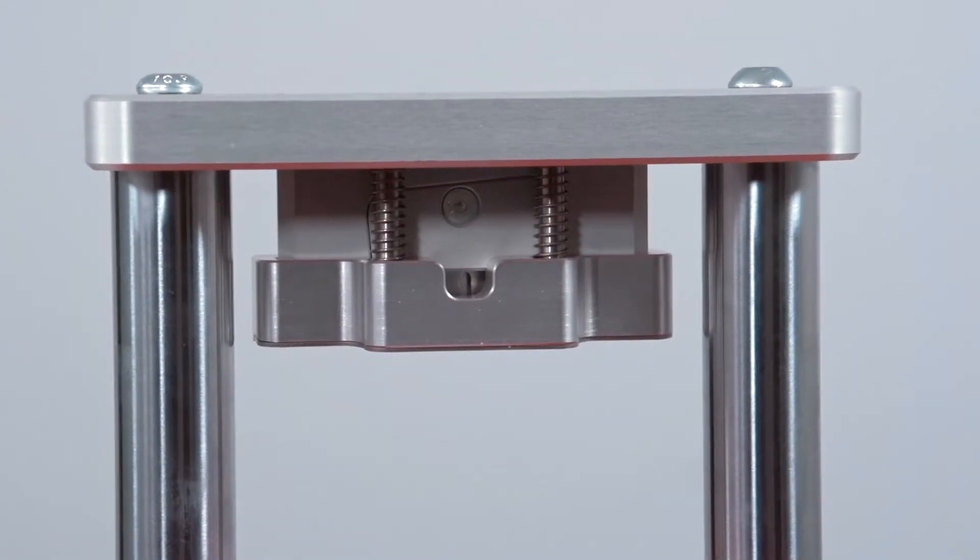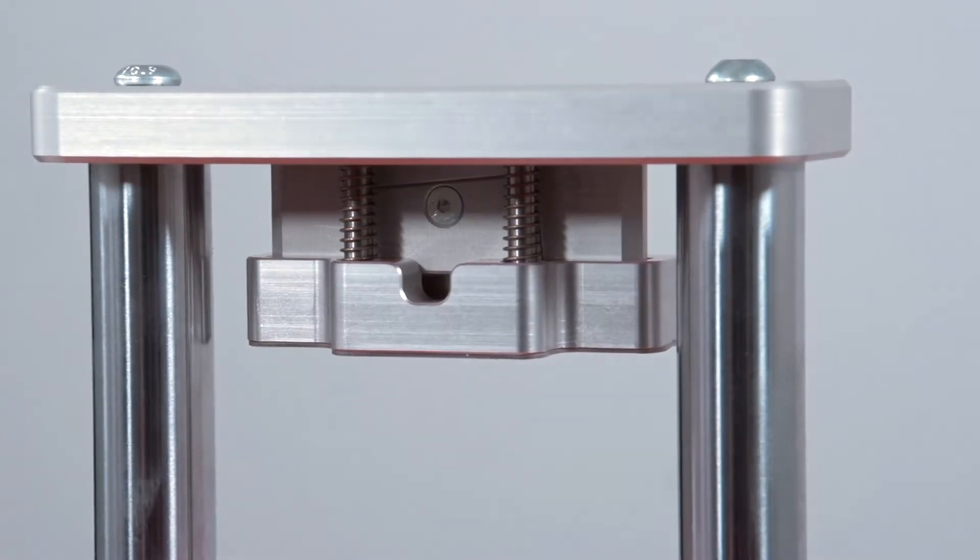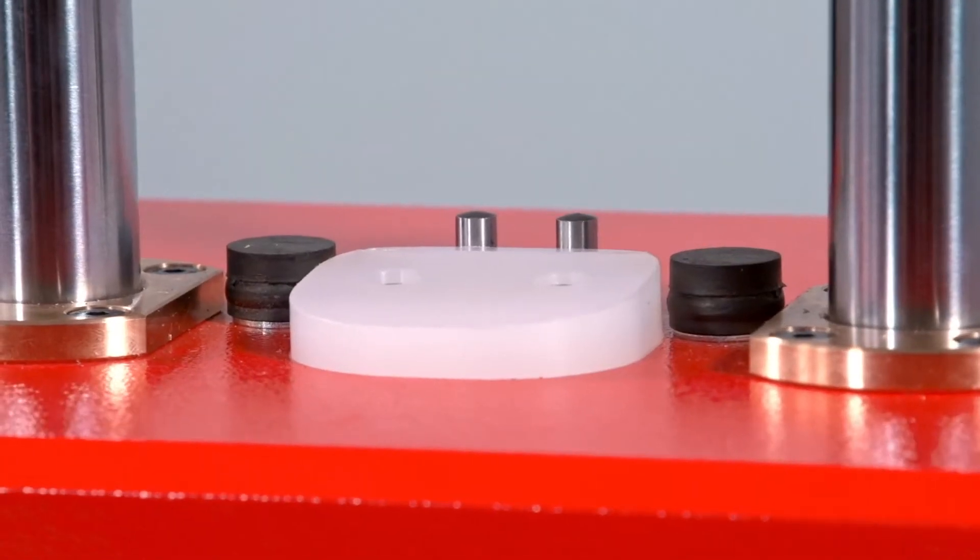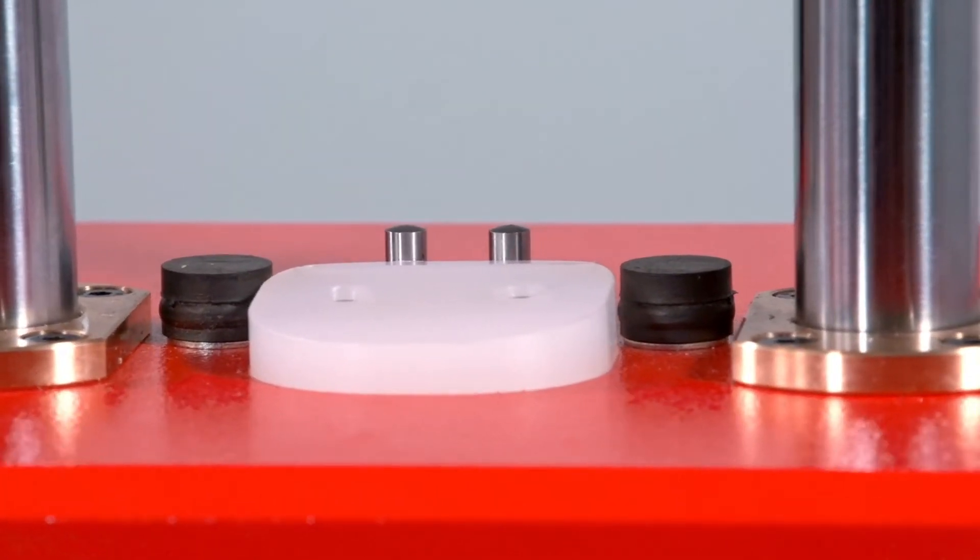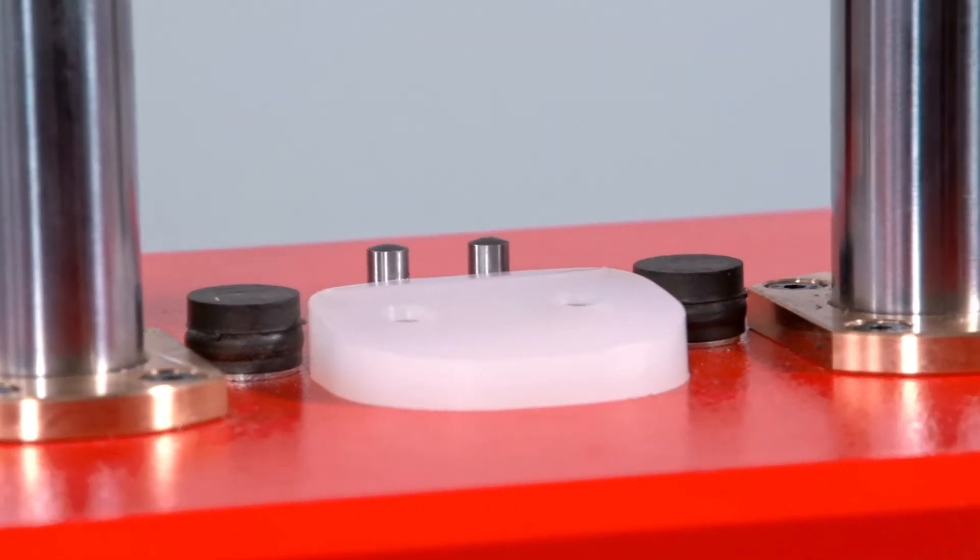The sharp single-edge blade is smoothly guided by precision ground blade guides to create straight and precise sectional cuts. Integrated end stops allow operators to easily position material on the cutting surface and ensure samples are cut with similar dimensions with each stroke.